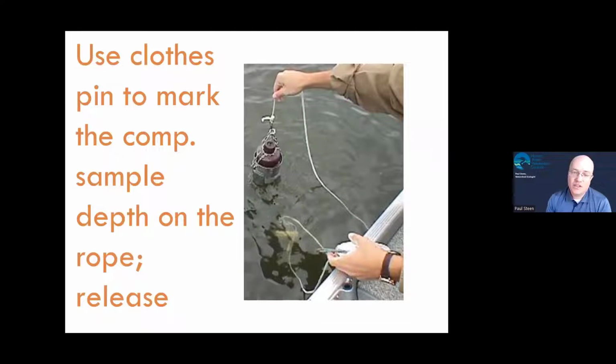And then you just release the sampler and let it free fall down. It will fall rapidly because it has the weights in there. And you stop it when it hits that clothespin at the water surface, because then you know you've gotten deep enough.